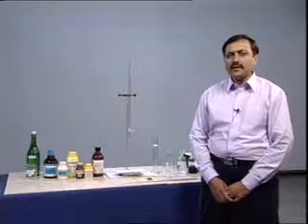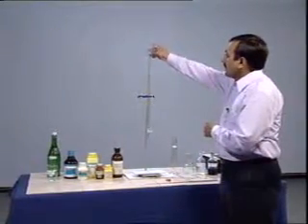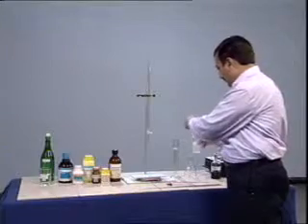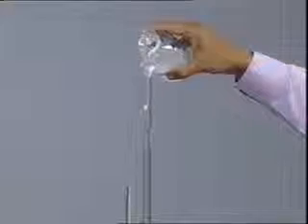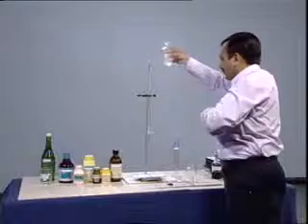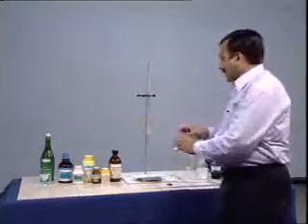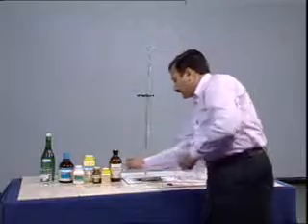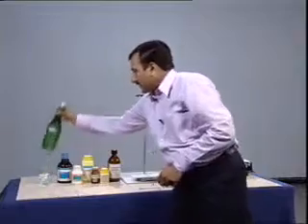First, we determine the total hardness. Fill the burette with the standard EDTA solution. As a matter of good practice, give some rinsing. Now measure 100 ml of sample.